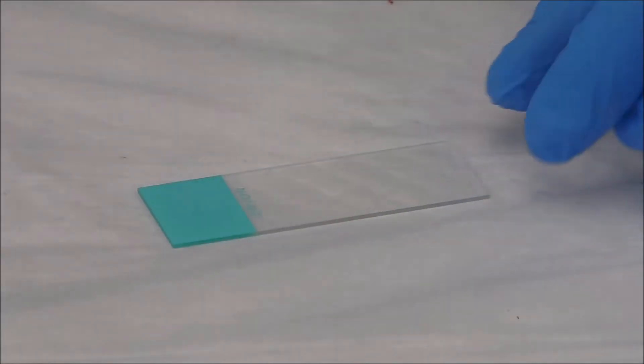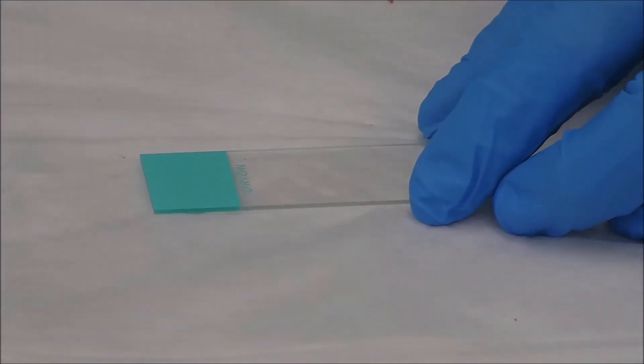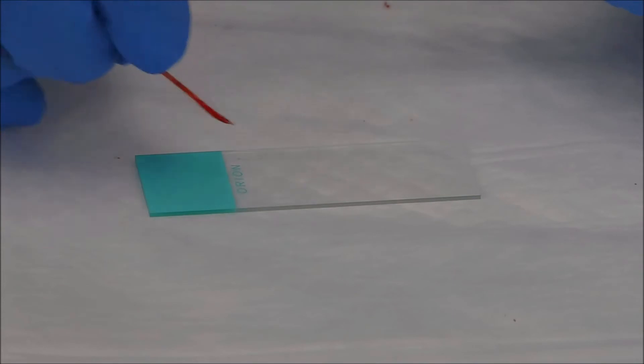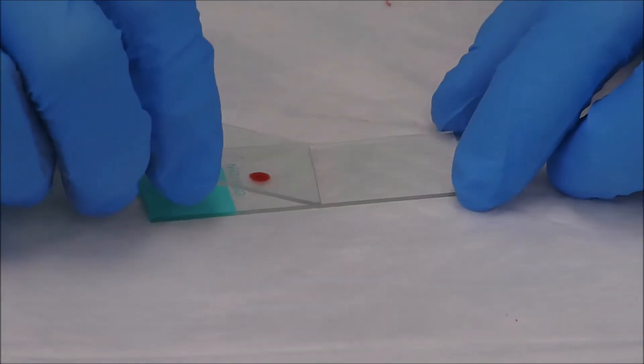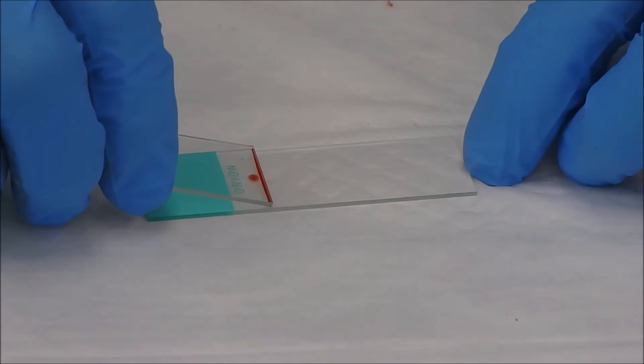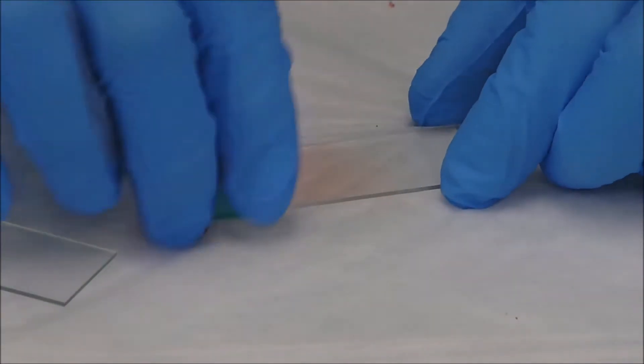Again, I get two slides out. I get my specimen slide, and then I get a spreader slide. And they need to be clean slides. Don't try to reuse your slides. I'm going to add another drop to my slide. And then I'm going to use my spreader slide to pull back about a 45 degree angle, and then push forward just like that.